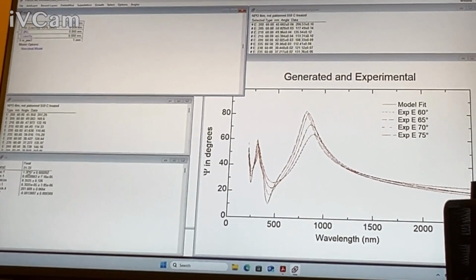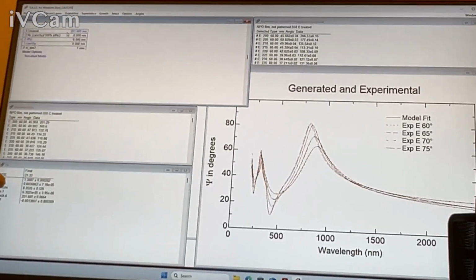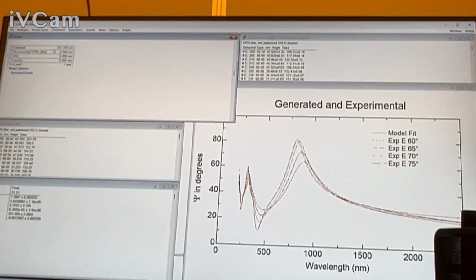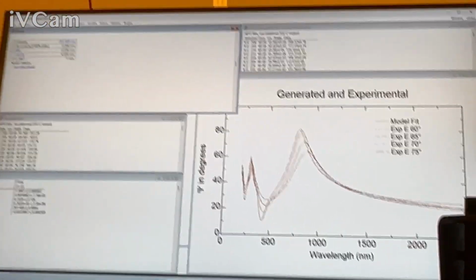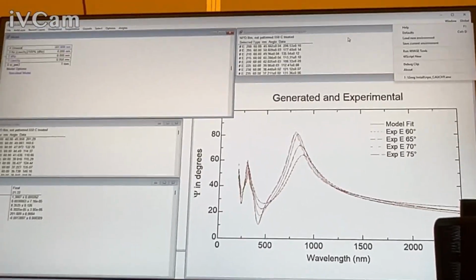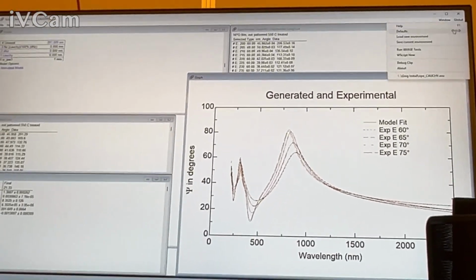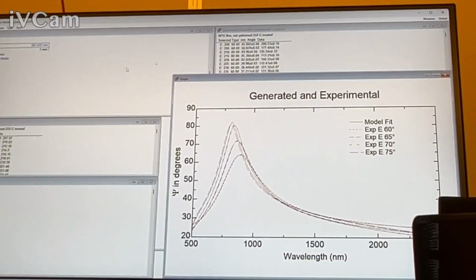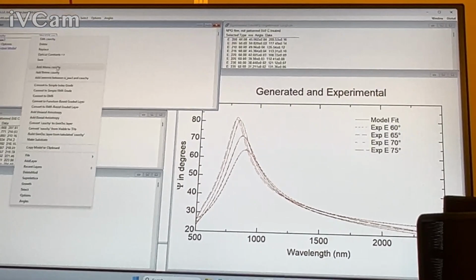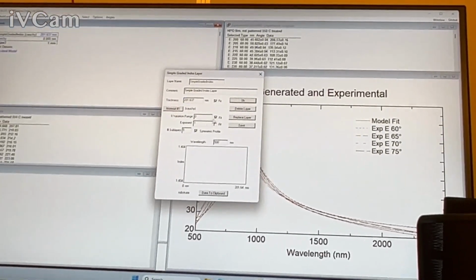So here it didn't improve the MSE. And if that MSE dropped from a 20 to a 10, I'd be like, hey, this might be showing uniaxial anisotropy. But that's the other thing I would kind of check on the sample. So the index grading of the optical constant, or a gradient, exactly, yes. If we went back to here, you could always try to add some simple grading just to see if it wants it.